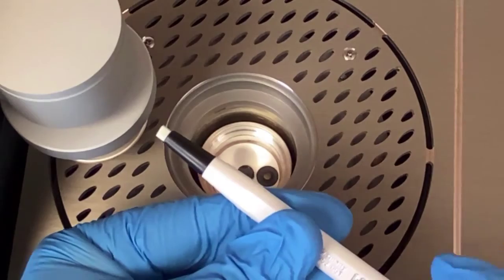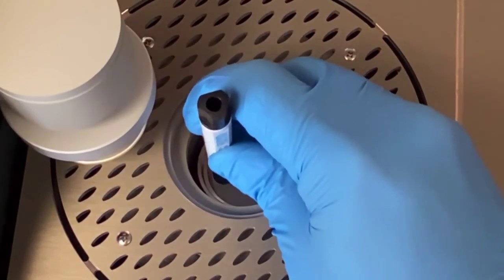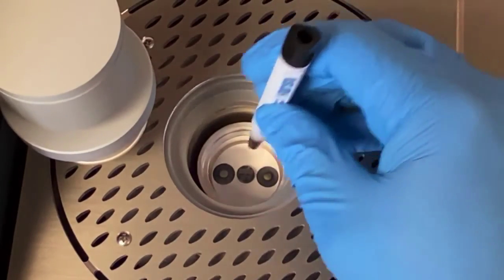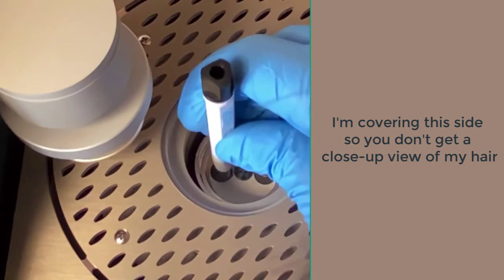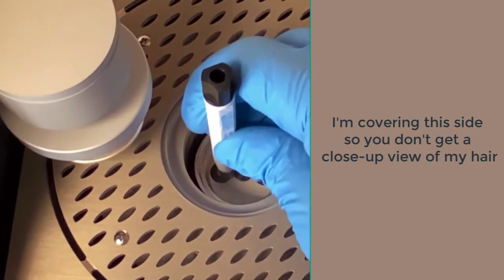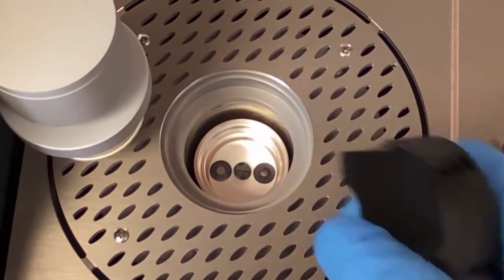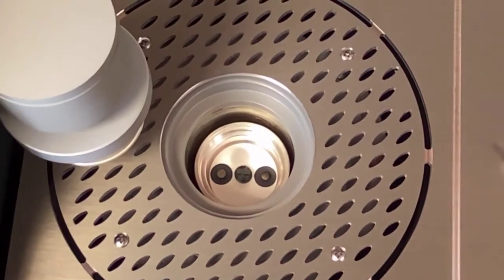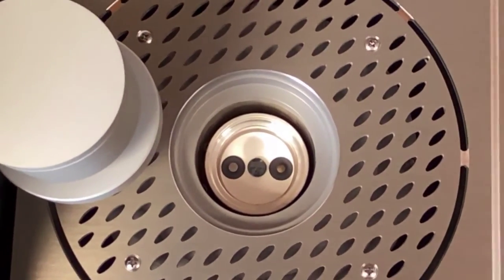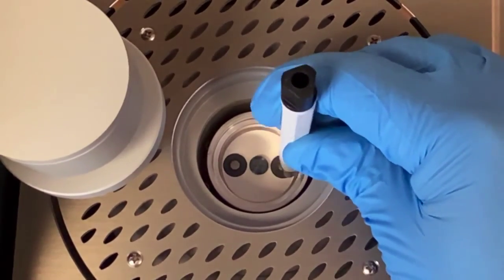That doesn't feel very good. I'm going to get a little more brush here. It still has a pretty wiry feeling. Getting somewhere. Okay, so that looks more shiny now. Then you can take a can of compressed air and blow out the little dust bits. It's probably a little hard to tell with the video, but one side is bright and shiny and metallic looking, and the other side is not. So now I'm going to do the same thing to the other side in order to get this cleaned off and looking the same.